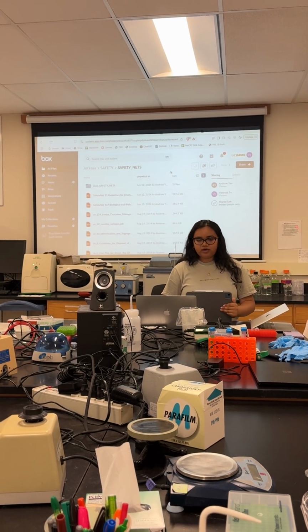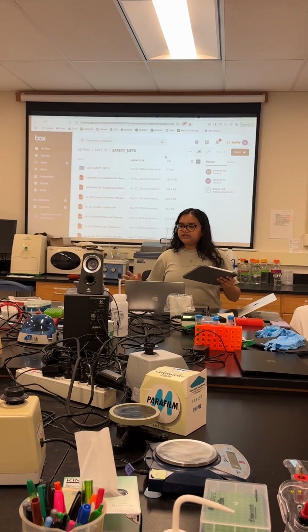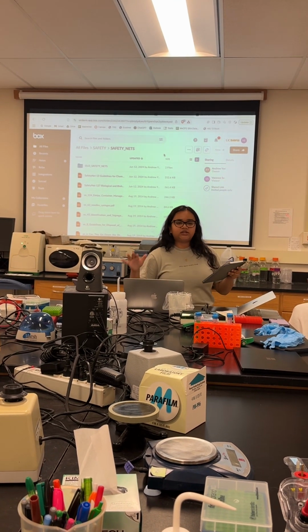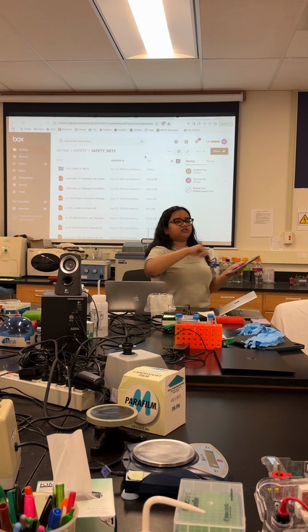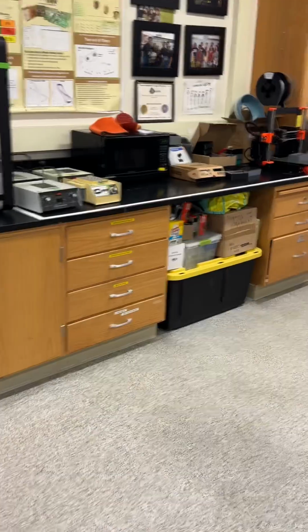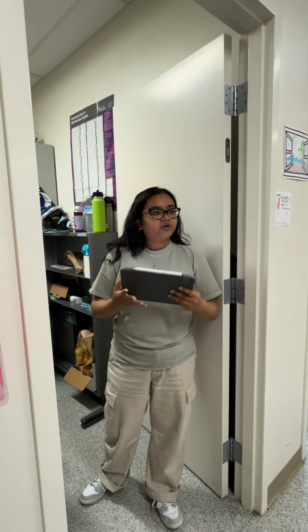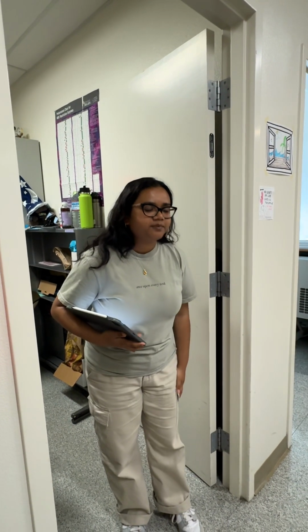But let's go ahead and get started with the in-person walkthrough. You don't need to bring anything. You can just leave your lab coats and everything. You can meet me at that back office, and we'll just form a little half circle and make our way through. Nobody can see? Okay, so first, remember we just talked about having long pants all the time.